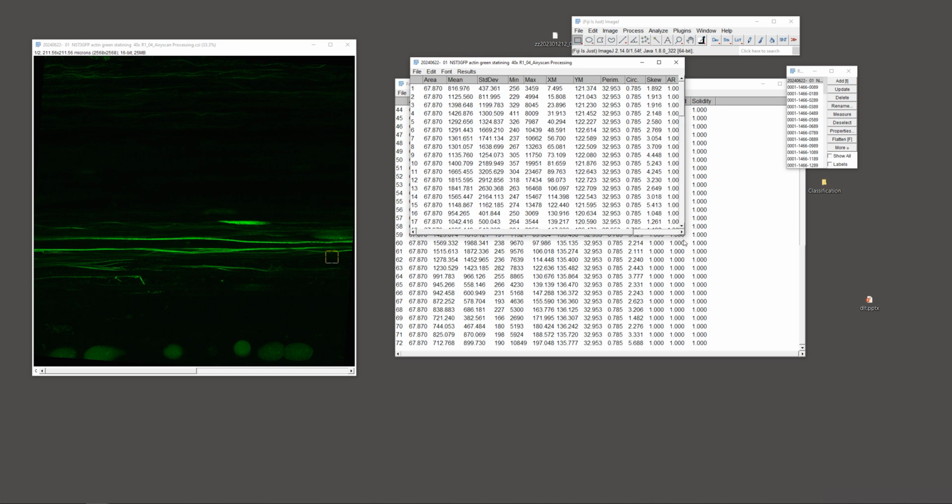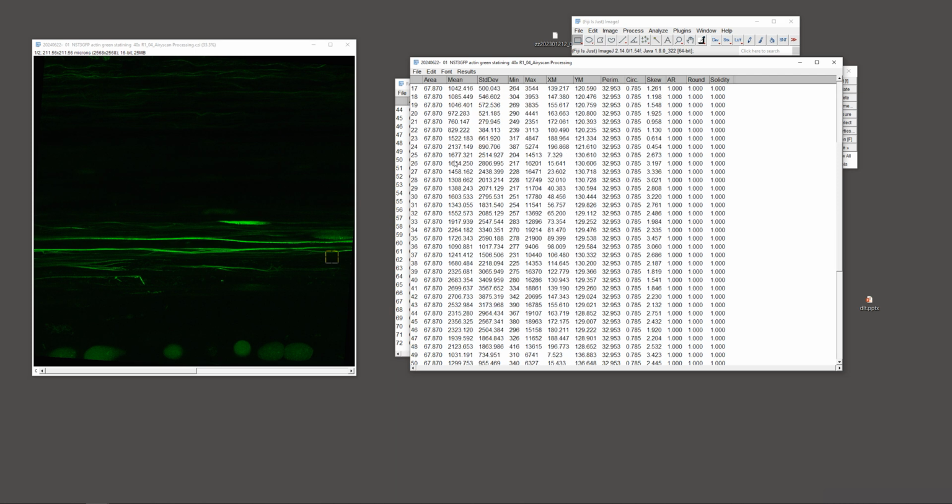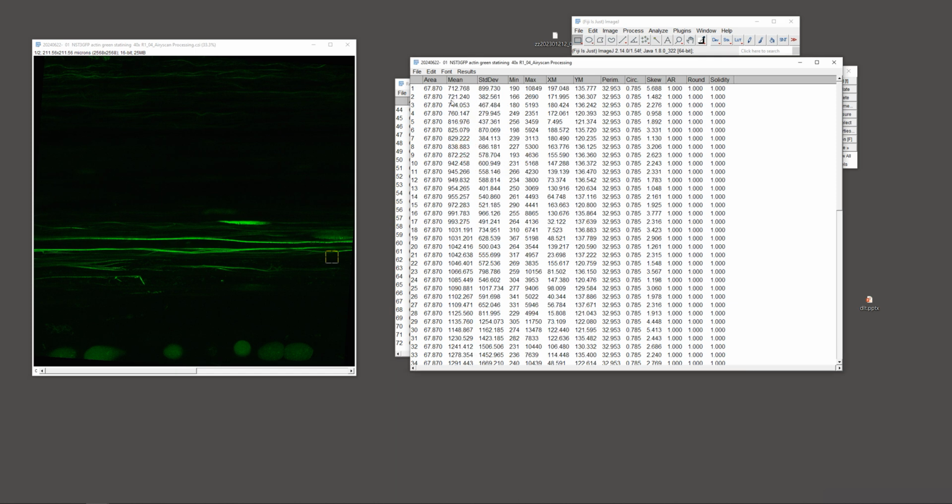In this way, I'm able to see how much is the intensity of each actin filament and where, and so on. When it becomes black, you will see it has a lower value. For example, if I sort it on the basis of mean gray value, and I say okay, then for example here and here, you have, for example, minimum and maximum.